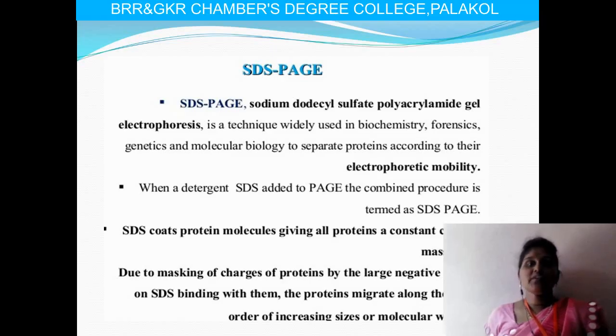Good morning students. In the previous class we discussed paper electrophoresis and gel electrophoresis. Now the new topic is SDS-PAGE. We already learned about PAGE, polyacrylamide gel electrophoresis. When PAGE is combined with SDS, we call it sodium dodecyl sulfate polyacrylamide gel electrophoresis.